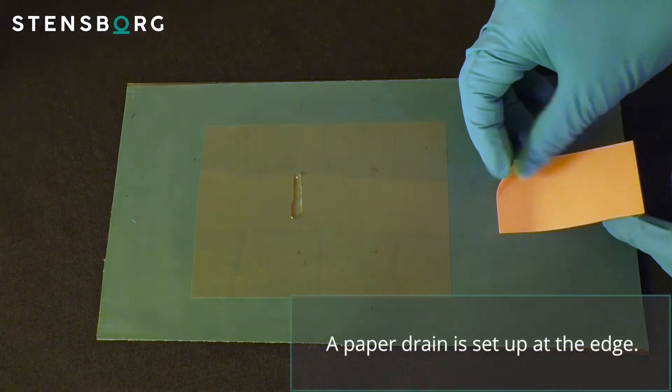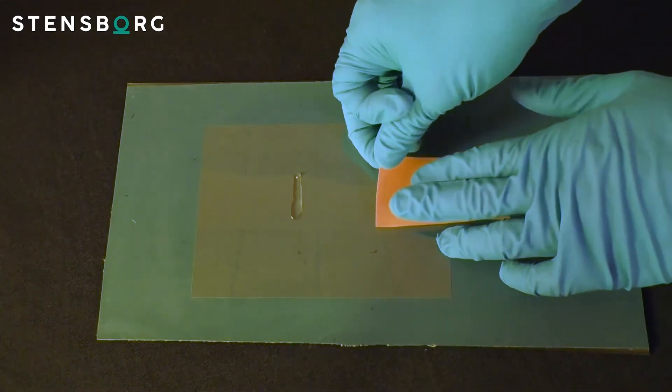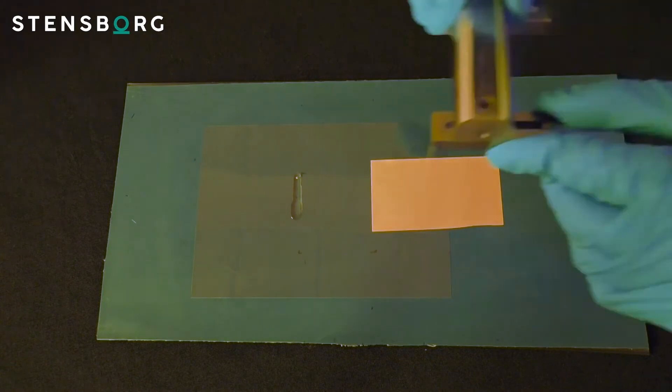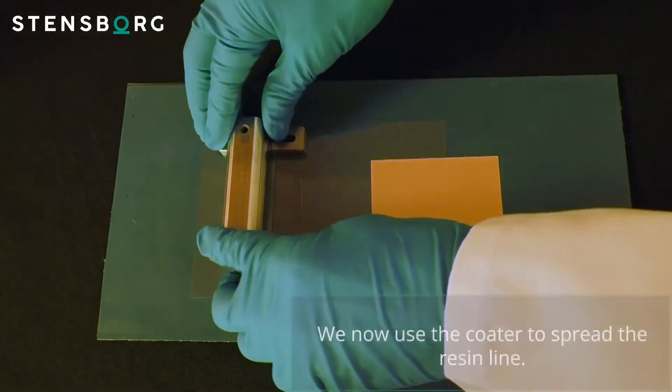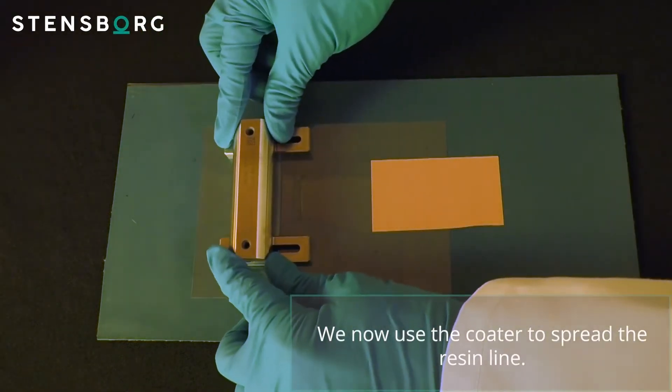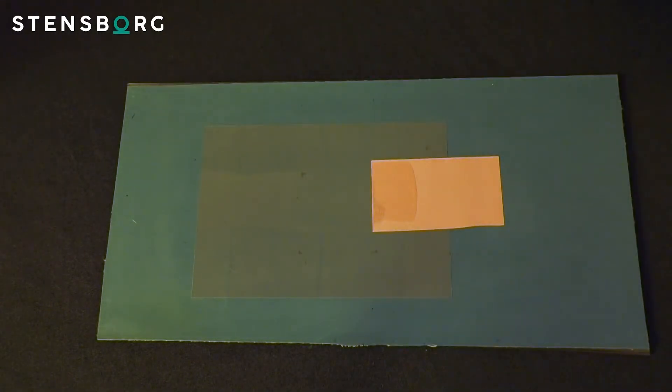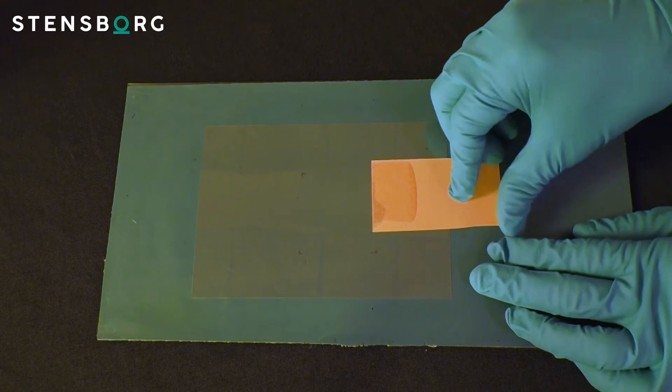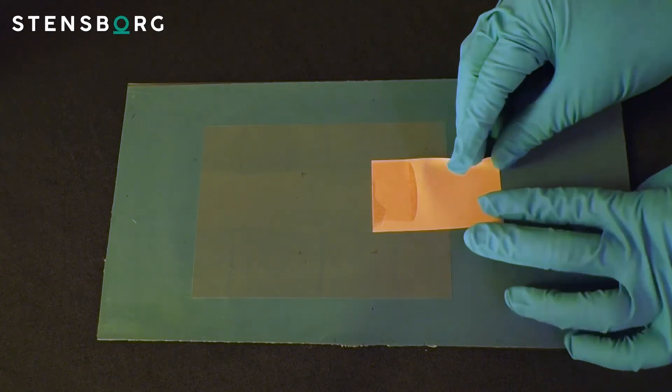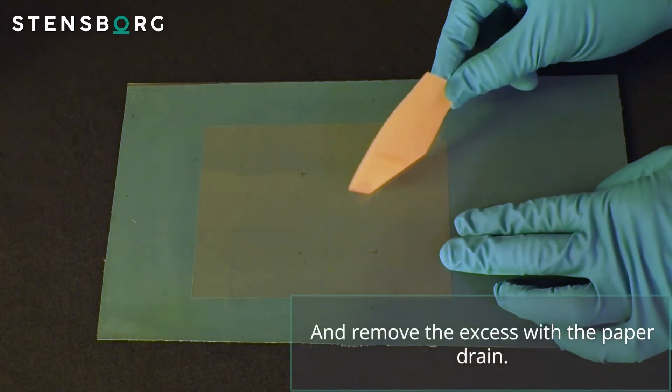A paper drain is set up at the edge. We now use the coater to spread the resin line and remove the excess with the paper drain.